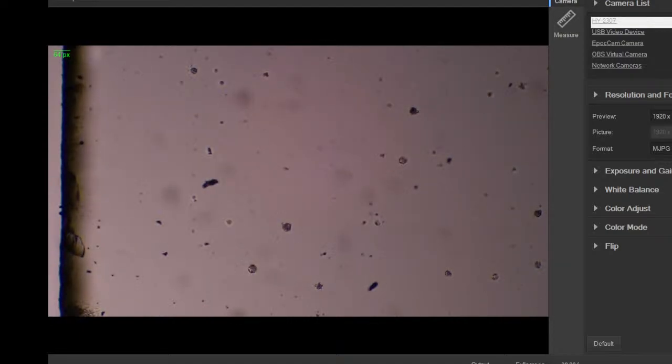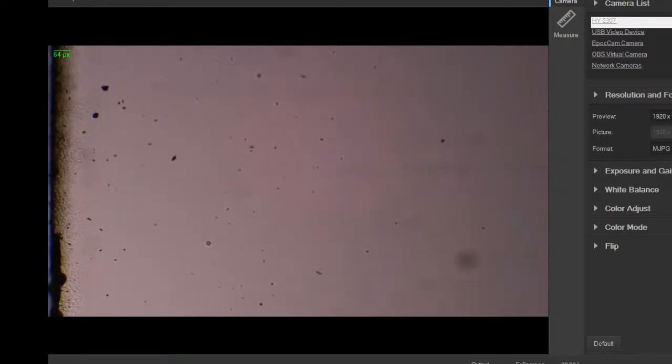So let's go through a few sections here. So far it's pretty dead. It's just a lot of random loose cells that are, again, decaying material.